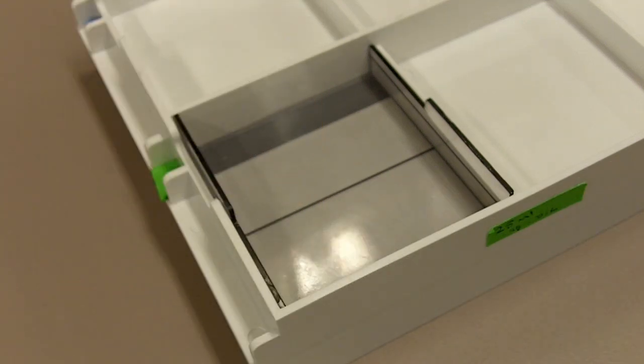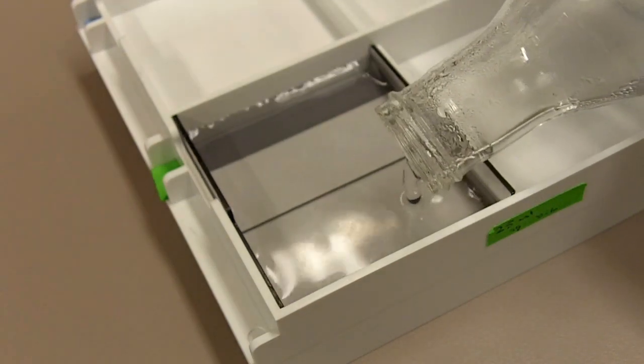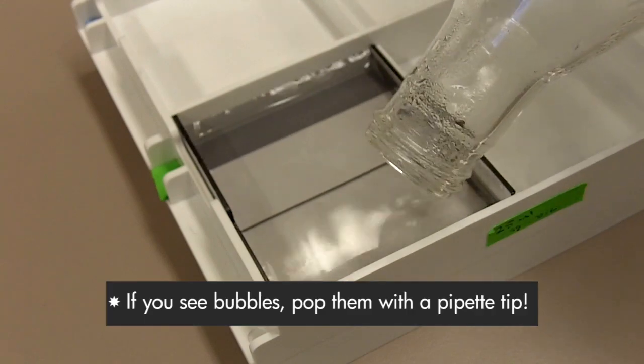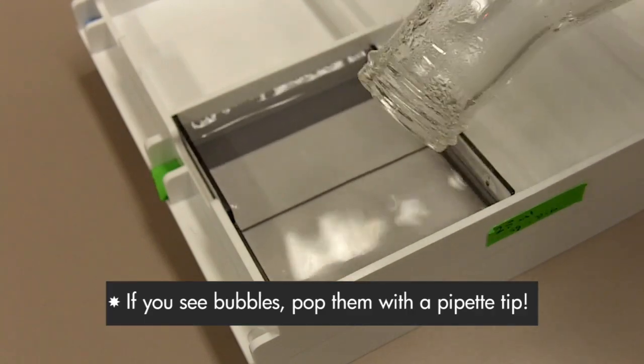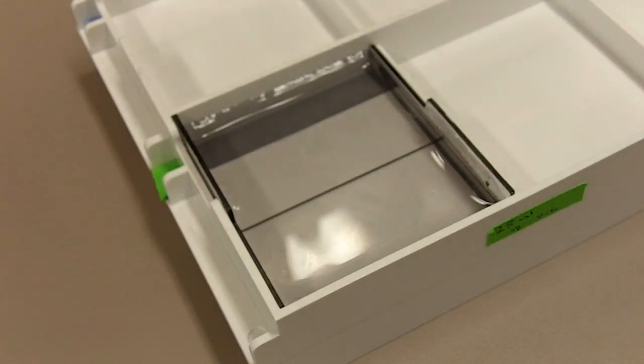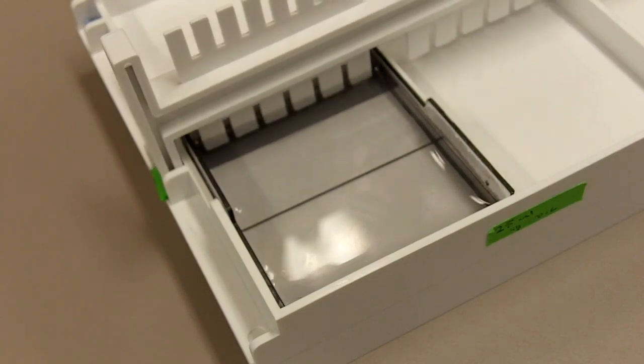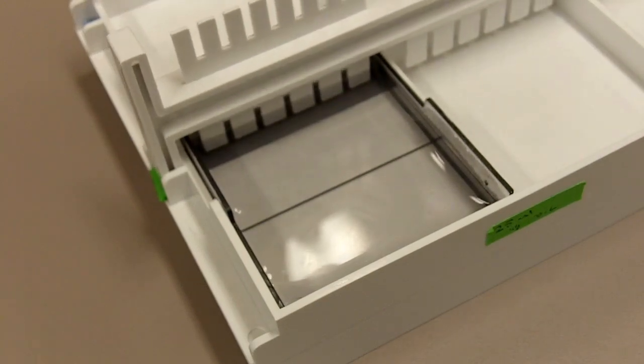After your agarose has cooled down we can pour the gel. Here's the casting tray for the agarose gel. Now what we need to do is slowly pour in the agarose so we don't introduce any bubbles. Make sure there are no bubbles and then we can put in the comb, like that and then we just have to wait until the gel solidifies.